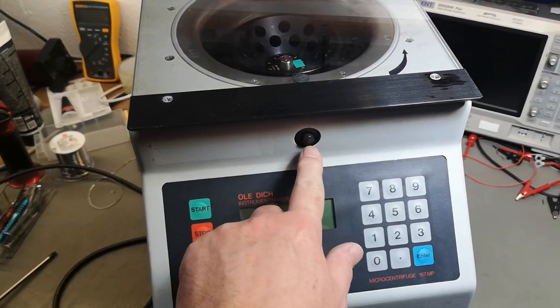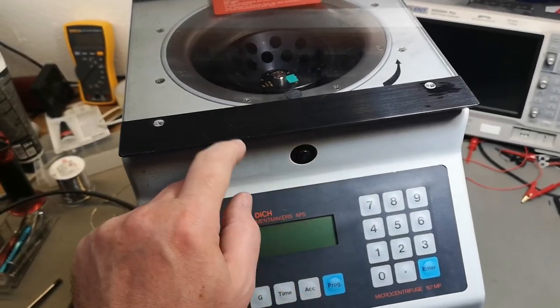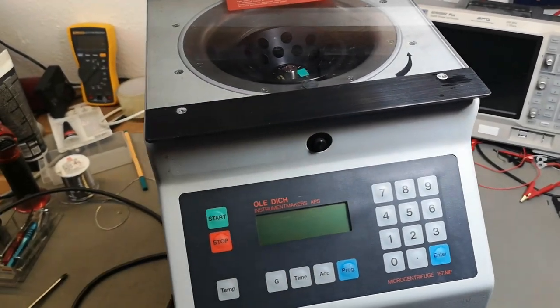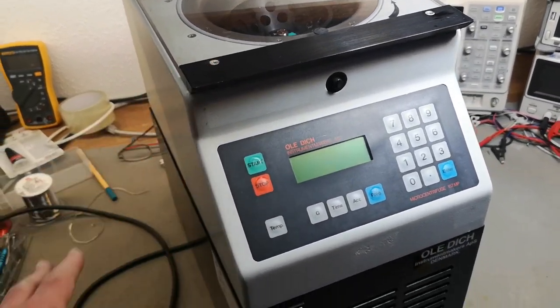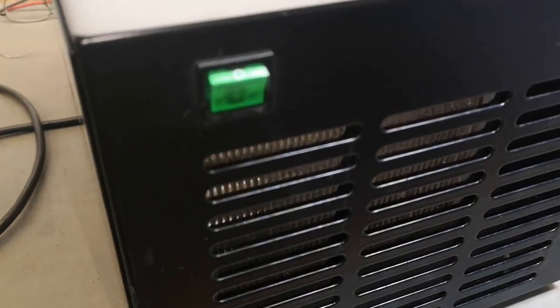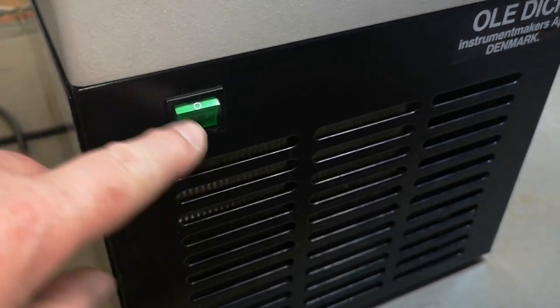There's a button to push but there's no effect at all — there's a click and it locks, but the lid is not able to open. There's also a power switch on the front that has no effect — I cannot move it at all.